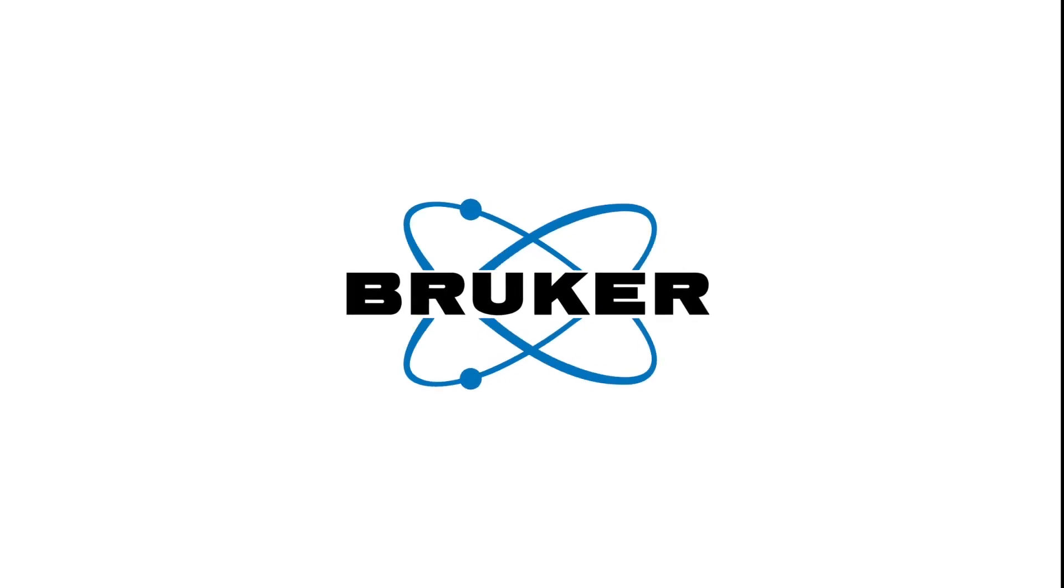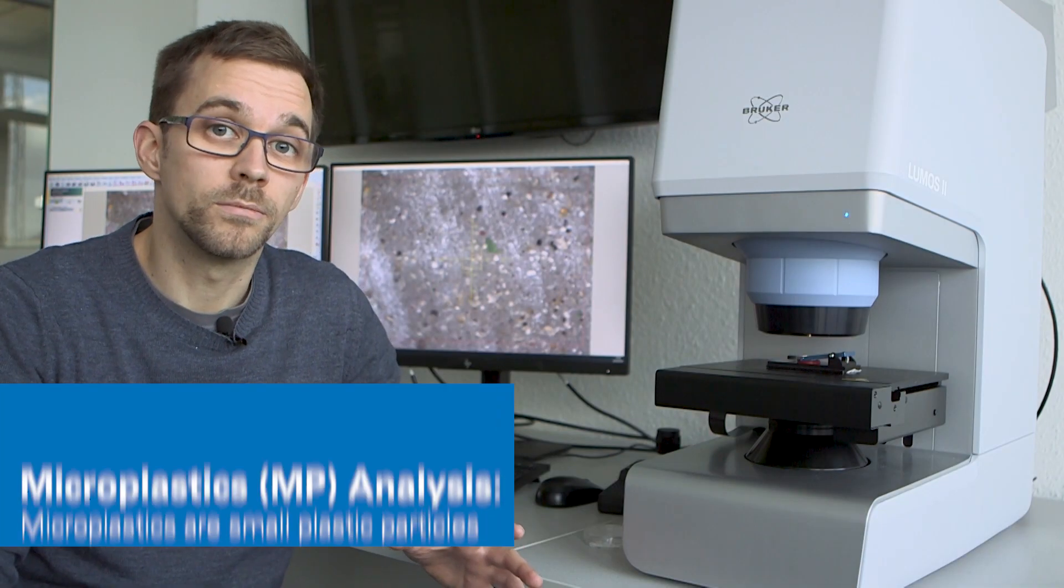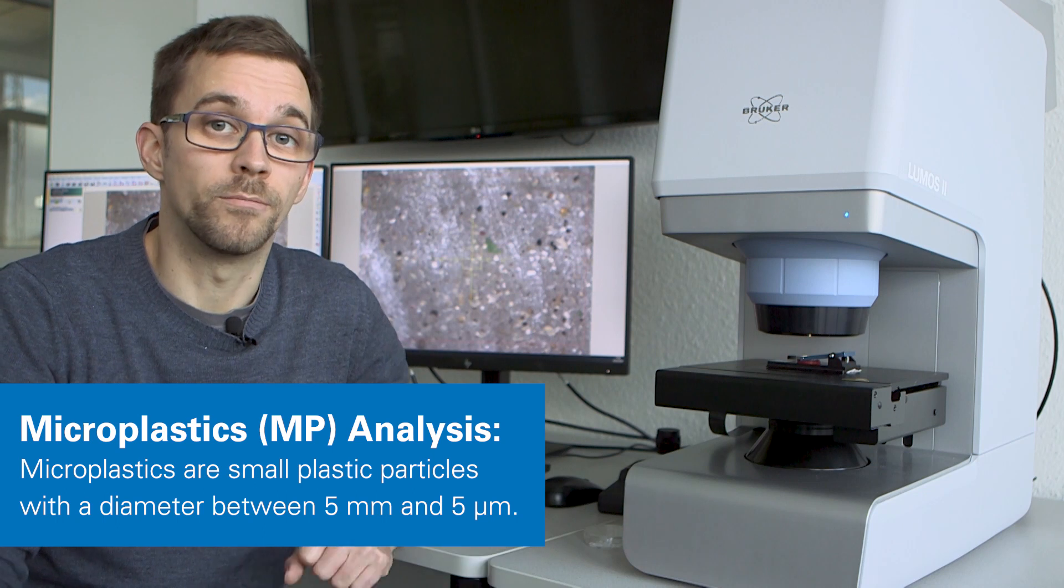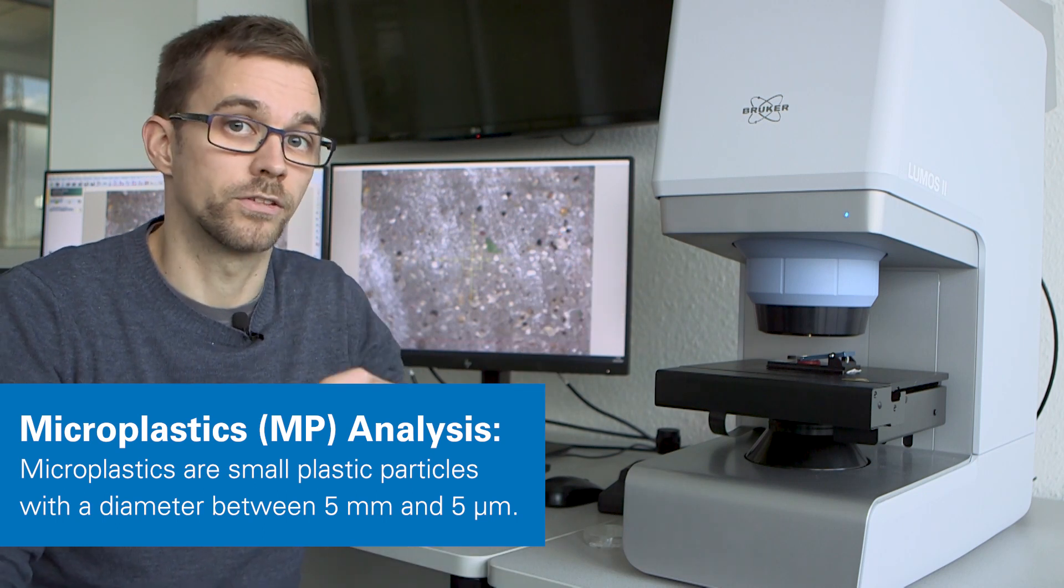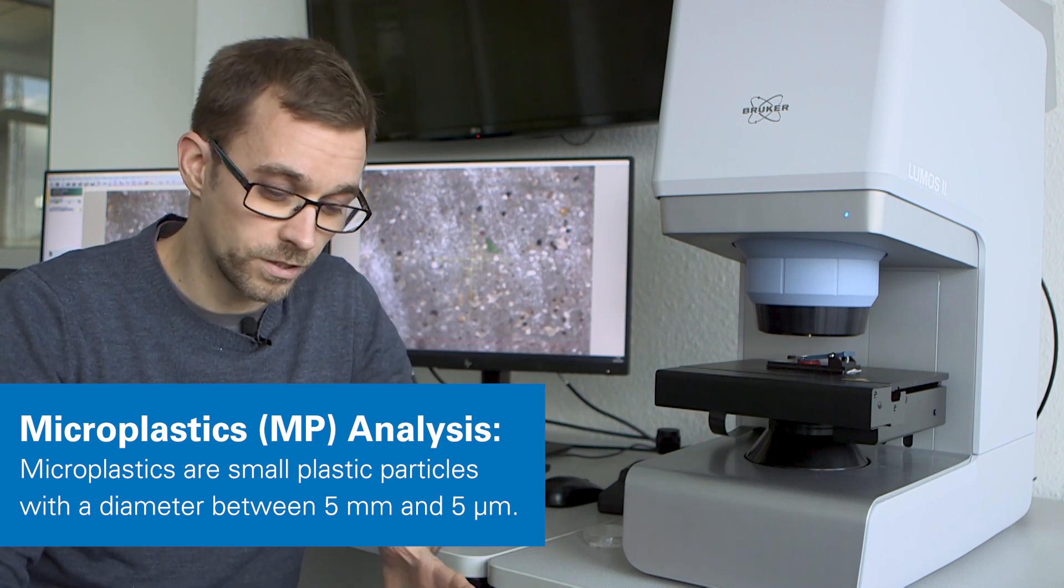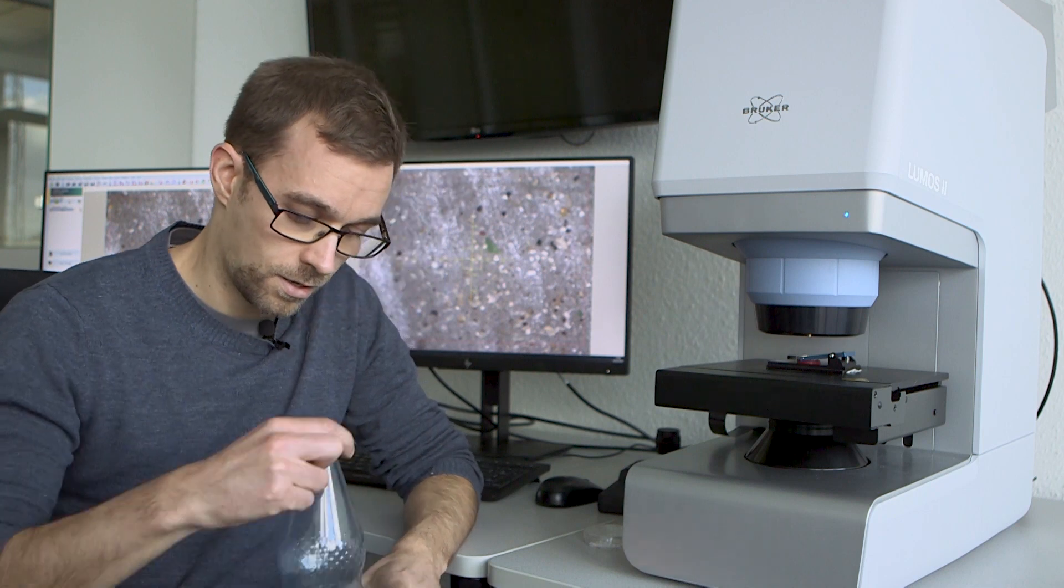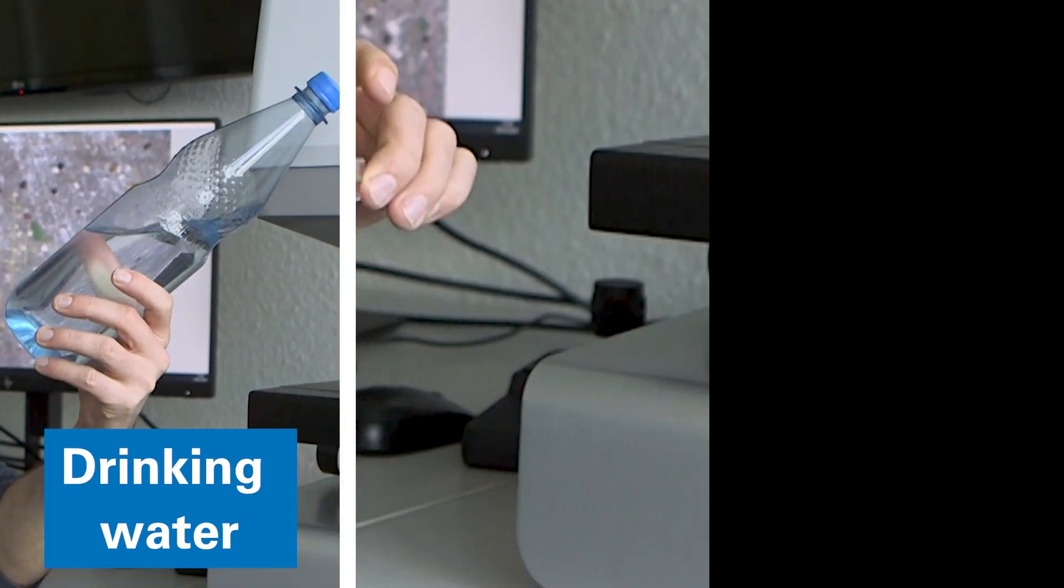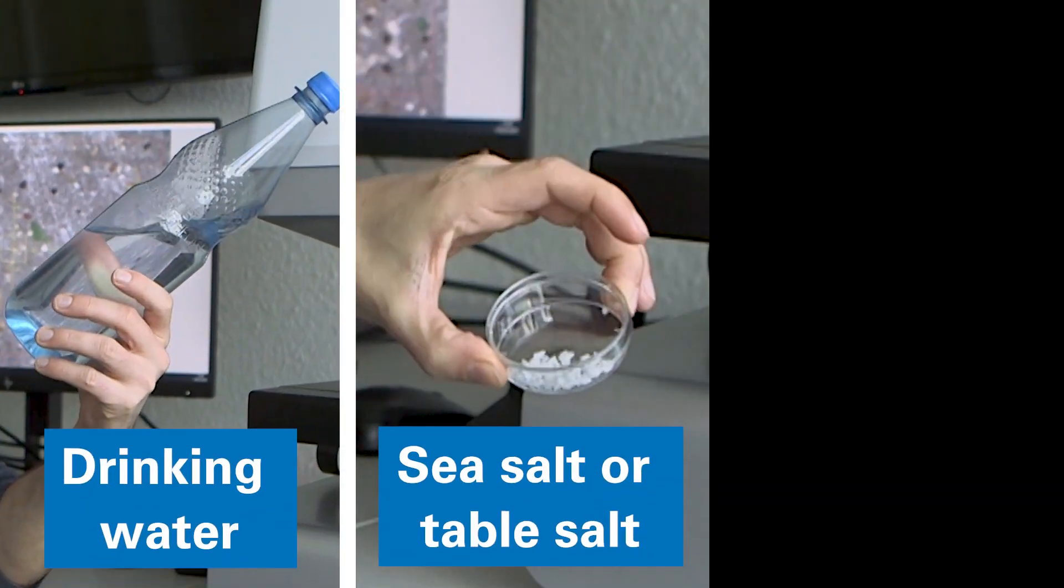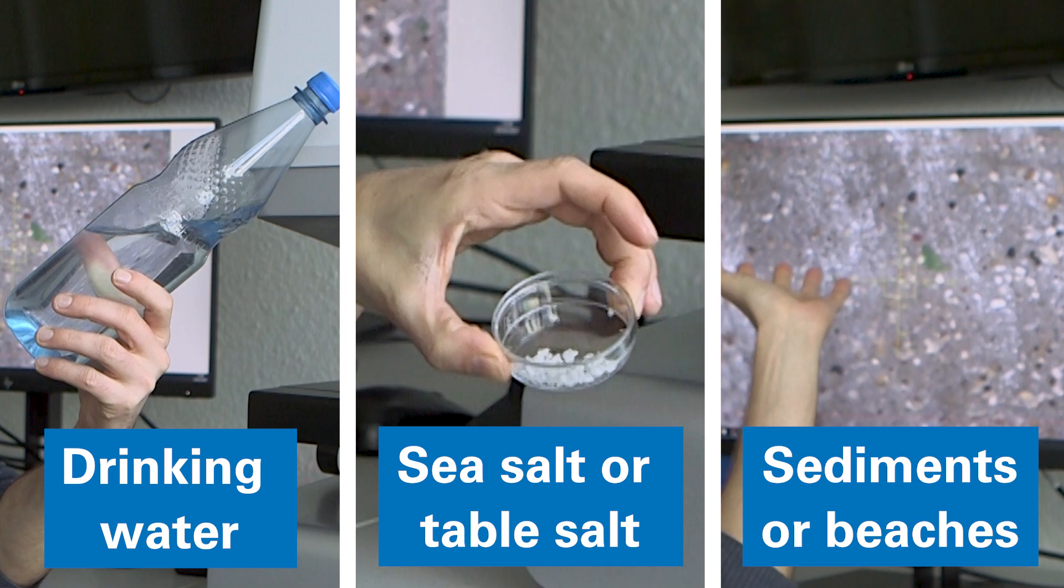In our last video, we talked about the analysis of microplastic by FT-IR imaging. To continue this important topic, I want to talk to you about the chemical mapping of microplastic found in drinking water, sea or table salt, or on beaches and rivers.